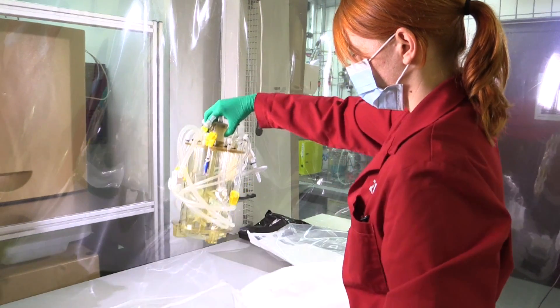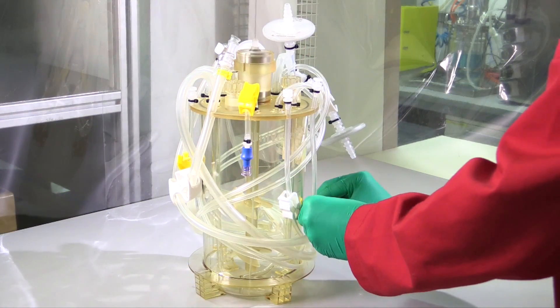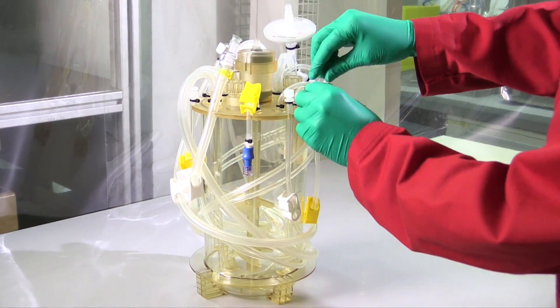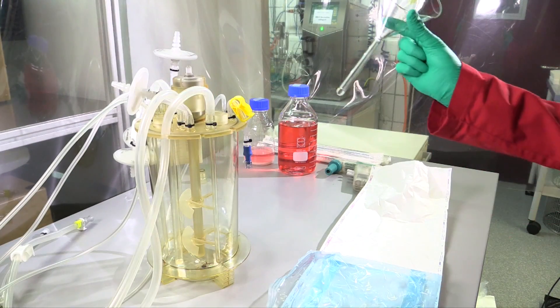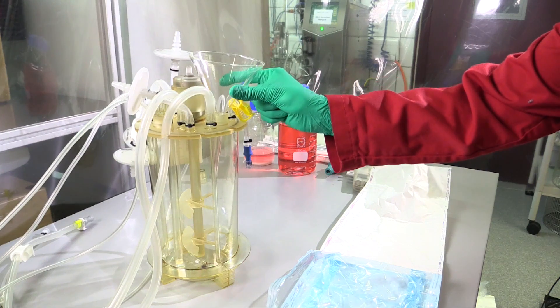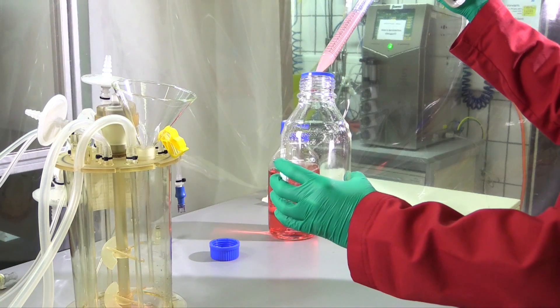After removing the univessel from the bag, all clamps are closed and the components are checked visually for damage or loose parts. Now a sterile funnel is inserted into a free sensor port and the bioreactor can be filled with the prepared microcarriers.